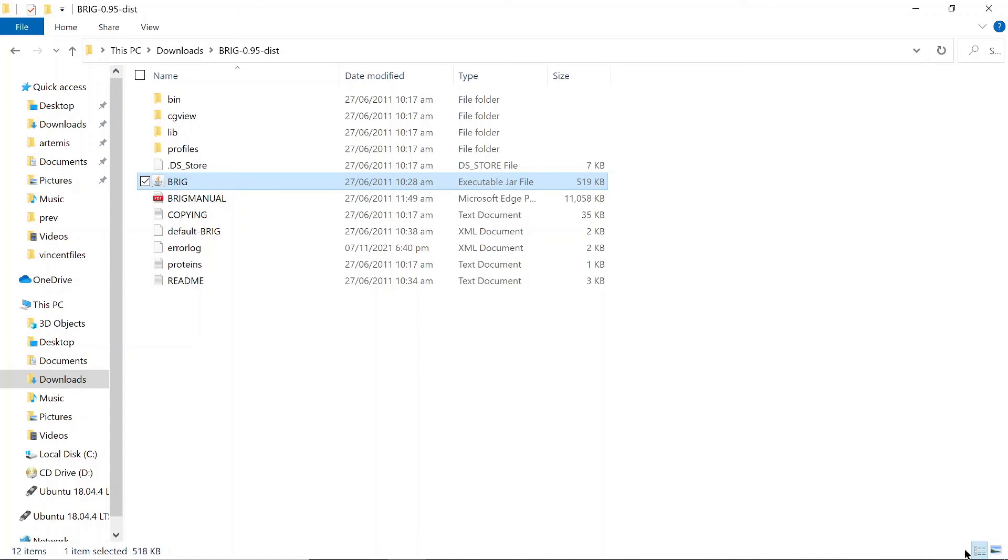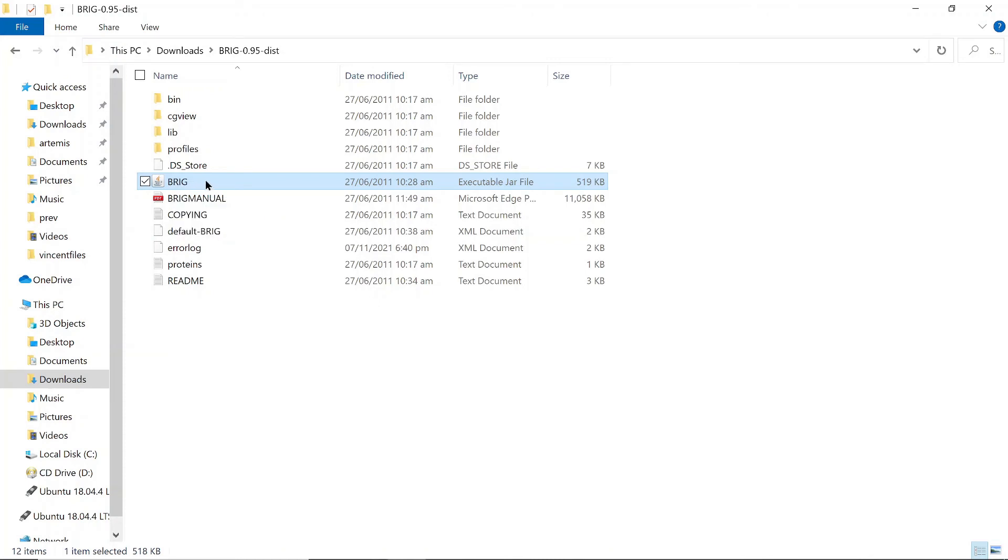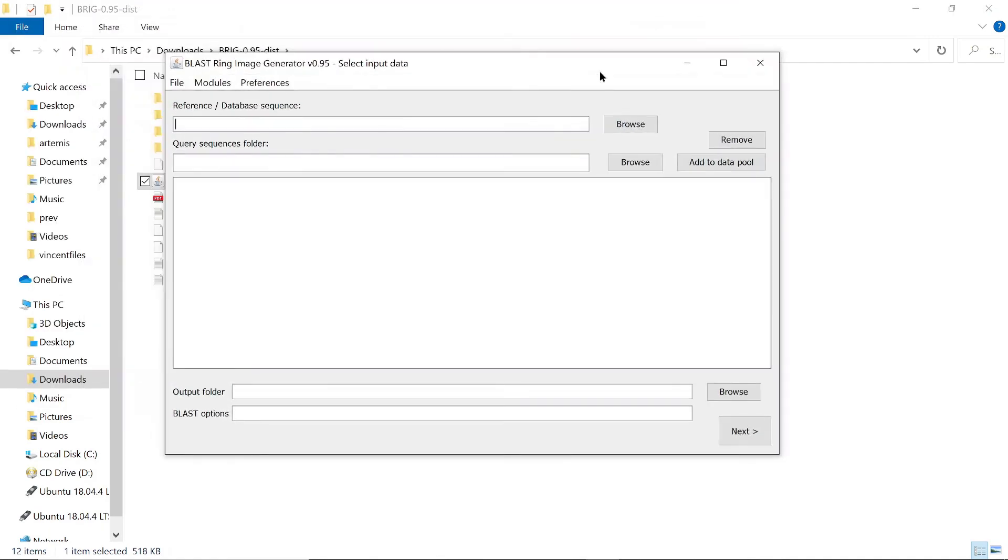And if your files appear like this, where we have the Java icon on the files, then all that you have to do is to just double-click on it. Like this one, the BRIG file here, and then it will open for you, just like how it's appearing now. So these are the two ways that you can use to open BRIG when you have downloaded it.